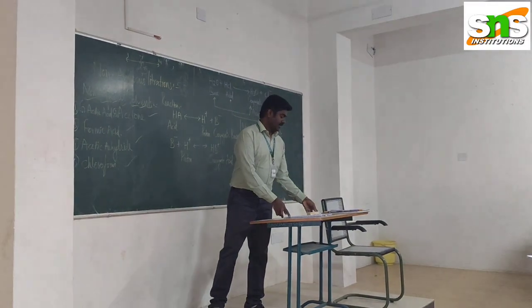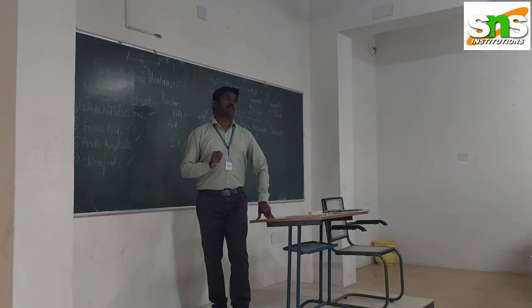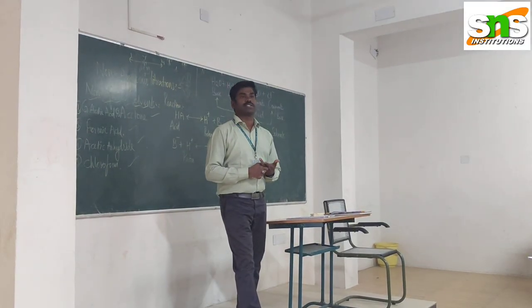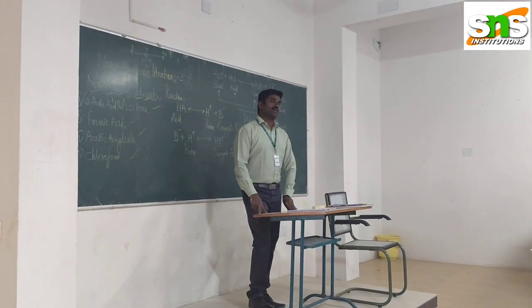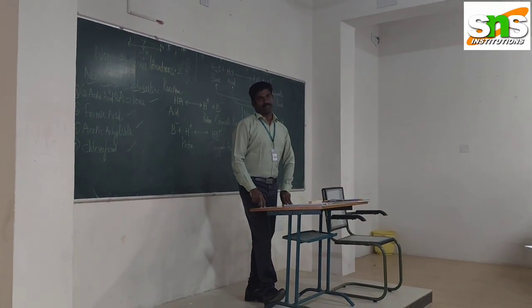Today, in my class, we are going to see about non-aqueous titration. I am handling the subject for B.Pharm learners in the first semester, Pharmaceutical Analysis 1 theory and practical. In this, today we are going to learn about the non-aqueous titration technique.